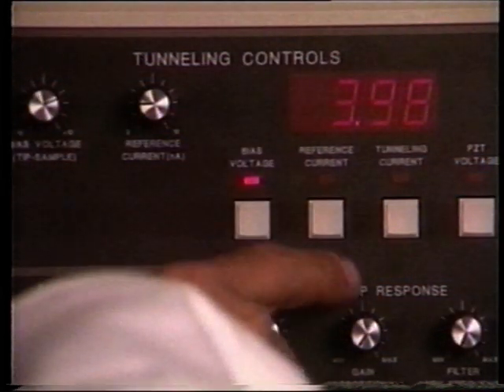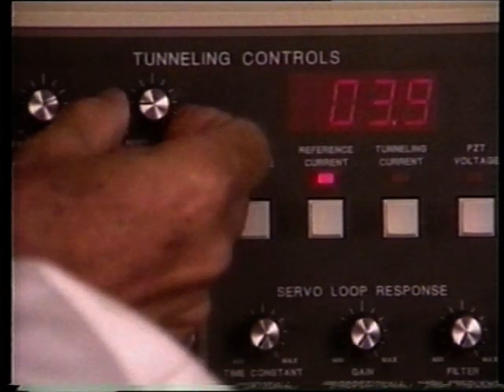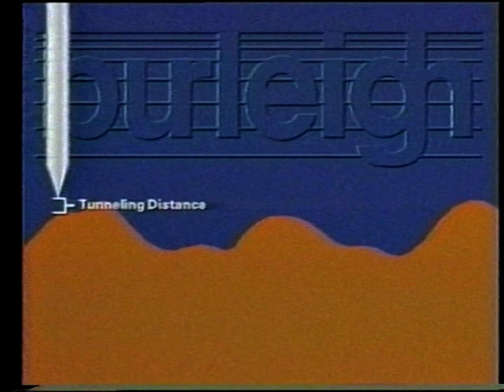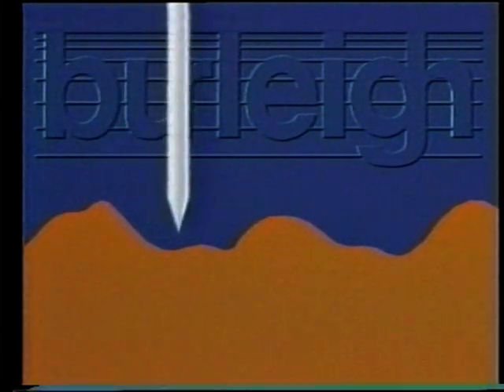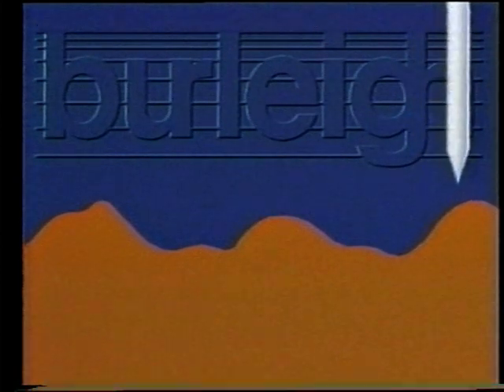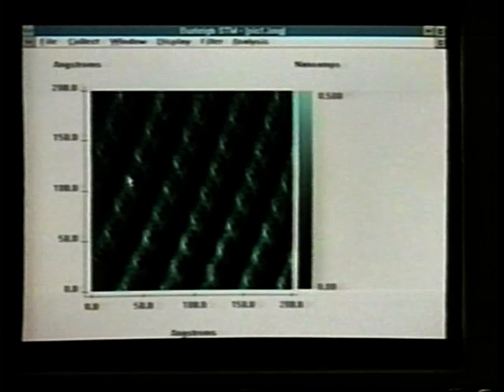The control electronics unit for the Instructional STM uses the concept of negative feedback to keep the sample and tip within a known tunneling distance as the tip is rastered over the sample. In the constant current mode, the tunneling current is sensed as it falls below or rises above the preset reference value, causing a corresponding increase or decrease in voltage to the Z-axis PZT. The correction and the tunneling current signals are then sent to the computer for storage and image display.